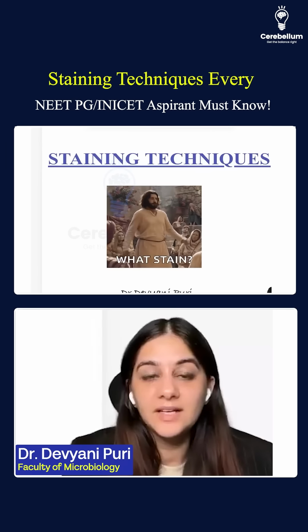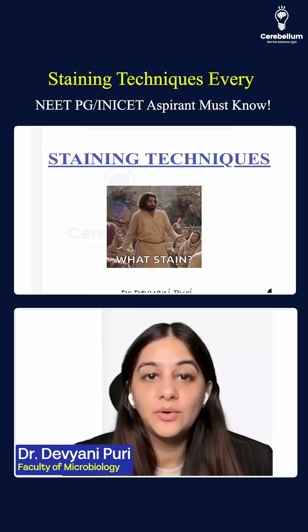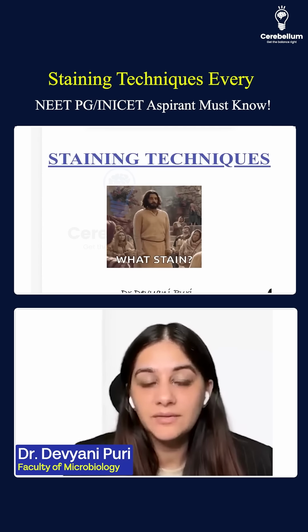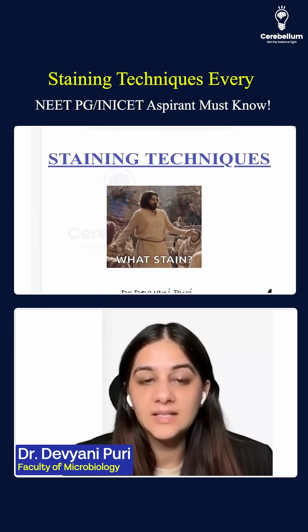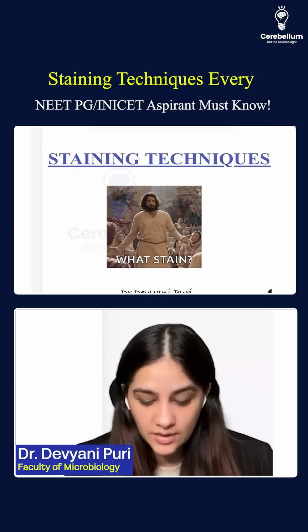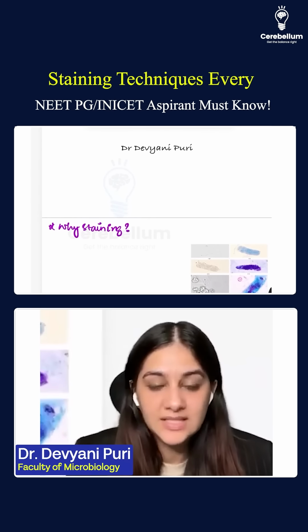Hello, everyone, and welcome to another session on general microbiology, where we are going to be learning about the staining techniques. We've already covered the morphology of bacteria, so now we want to see how we can stain the different bacteria. The first thing we're going to start with is: why do we even need staining?